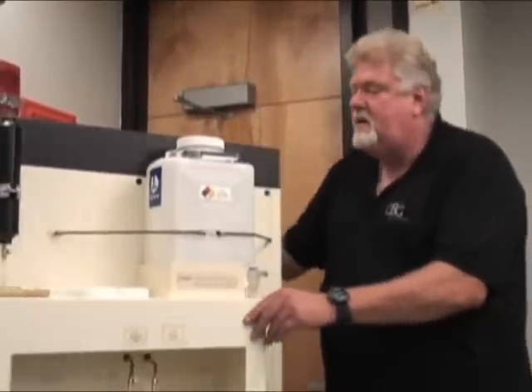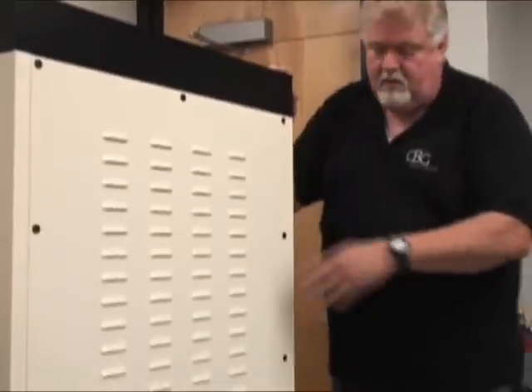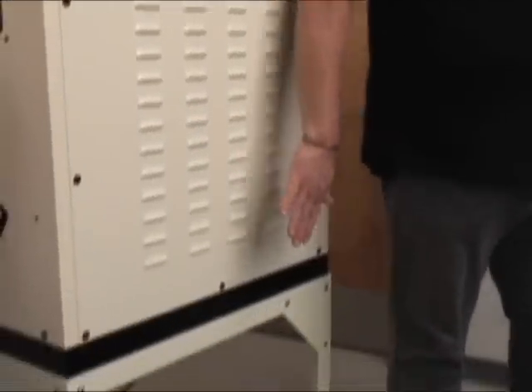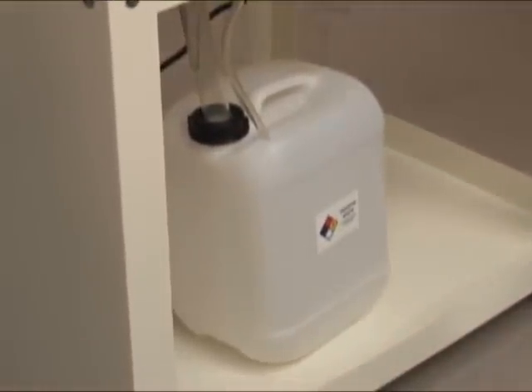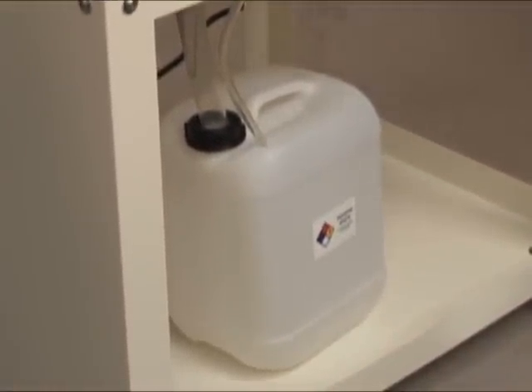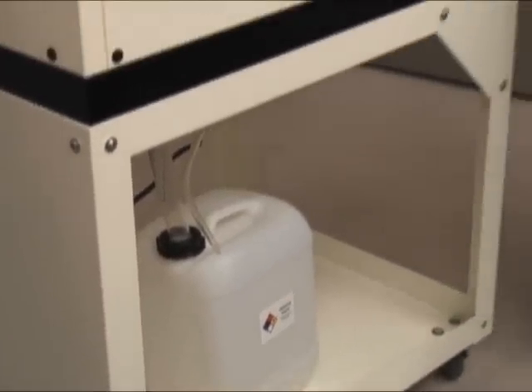Then the final waste, which you'll pull around here, is this paraffin waste container. Any paraffin that's in your xylene will go in here. In most processors in laboratories and standing lines, you de-paraffinize your slides or clean out your processing tank, so there's paraffin in it — and it goes into this container.